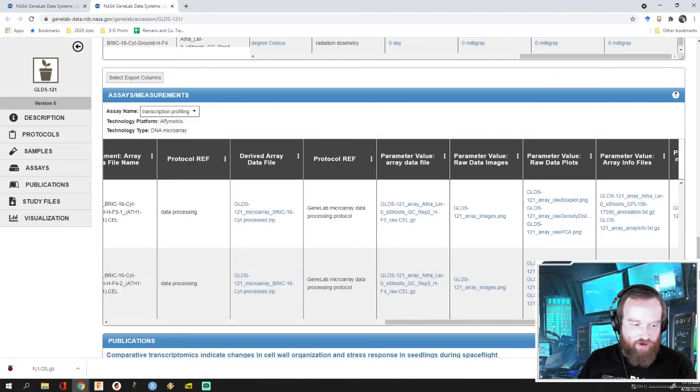I'm not going to download them all because I already have, but I want to show you what this will end up looking like. So if I go, I'll bring it over here in a second. Once you download those files, they are .gz files, so they're zipped. You need to unzip them because they're packaged. You can't open them without that.